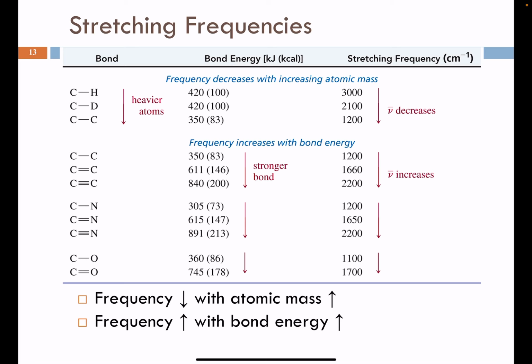Okay, so you can see here that a lot of series can be listed for us to prove some of these points. The carbon-carbon single bond has a weaker bond relative to the triple bond. Same masses are present in the form of carbon atoms, and so this lends to a nice series. And so the carbon-carbon single bond should be found at low wave number, low stretching energy, or low bond energy, and that should be a low frequency oscillation.